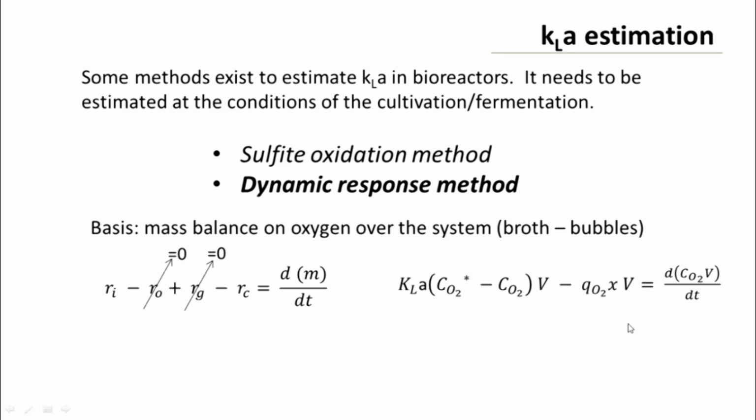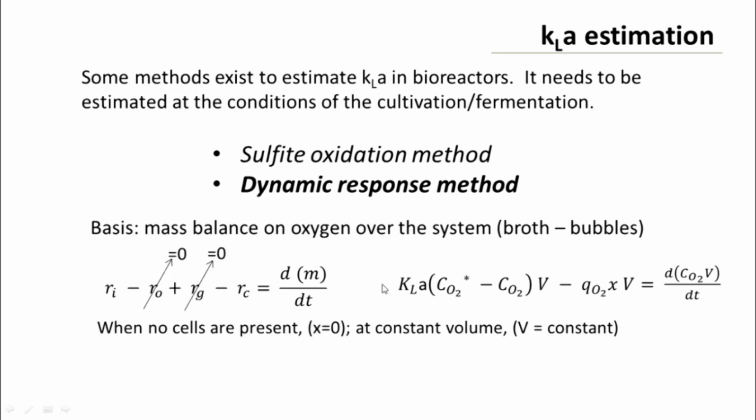I'll tell you what QO2 is. QO2 is the oxygen consumption rate per cell concentration. On a cell concentration basis, this is the oxygen consumption rate.